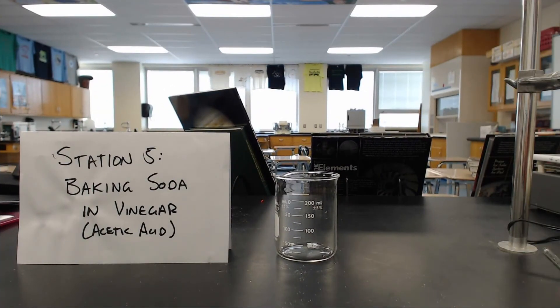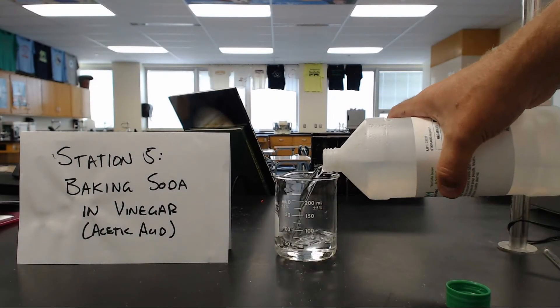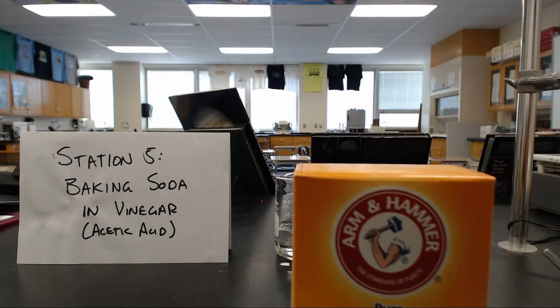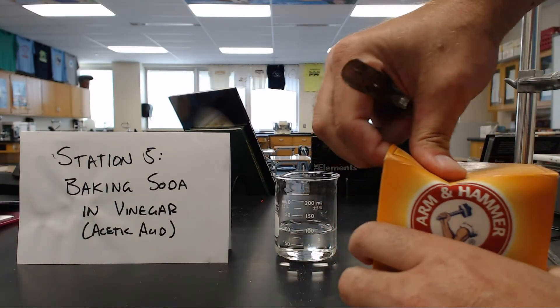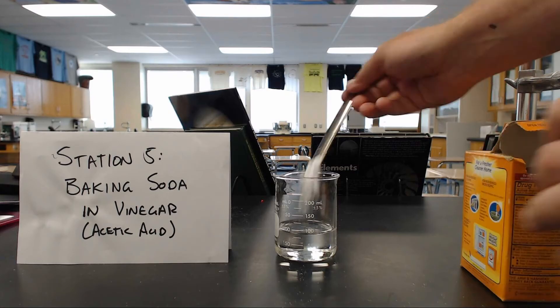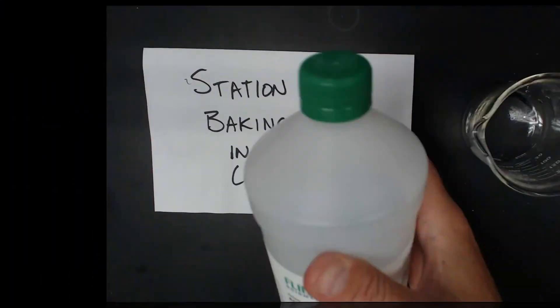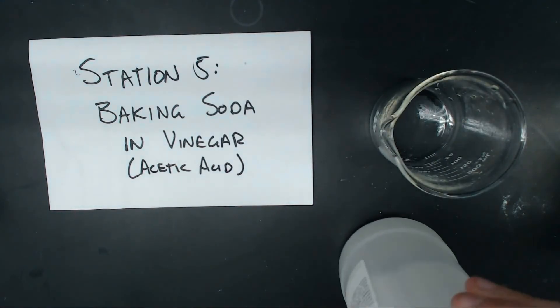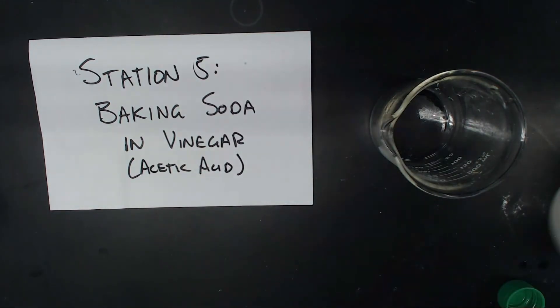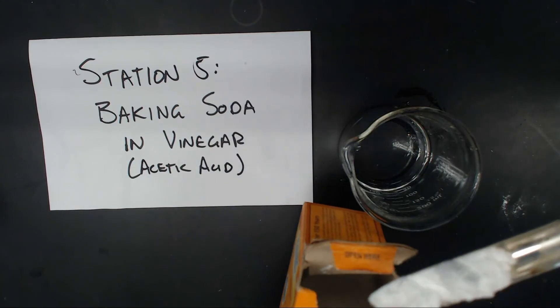We are going to mix vinegar, which is also known as acetic acid. I'm going to take a little bit of this and put it in this beaker. We have baking soda right here. I'm going to open it up a little more and mix this right here — you can see what happens. We'll do the same thing except from a top-down view. We have acetic acid right here, you can see the label. I'm going to add this to the beaker, then take a scoop of baking soda and put that scoop of baking soda right into the vinegar.